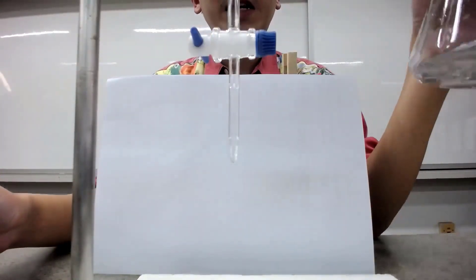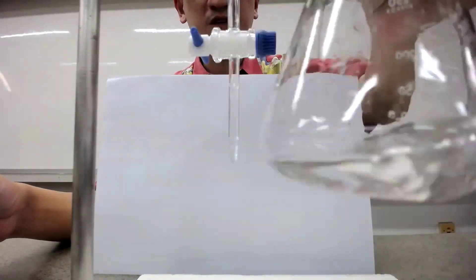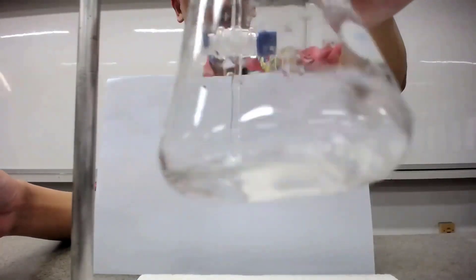For this acid-base titration, so this is the acid — the diluted acid — if you recall from the experiment. So it's a colored solution.